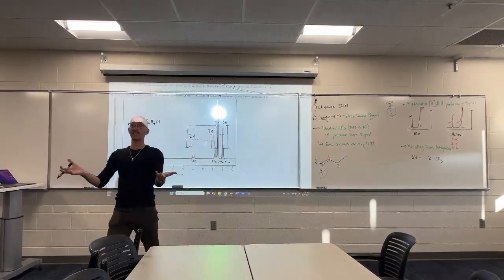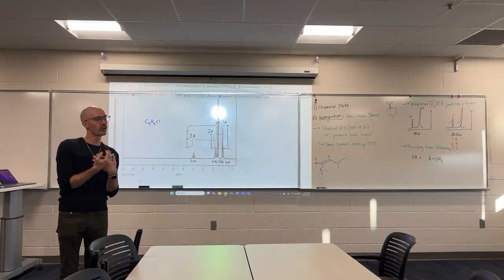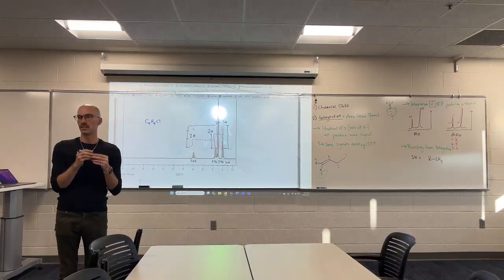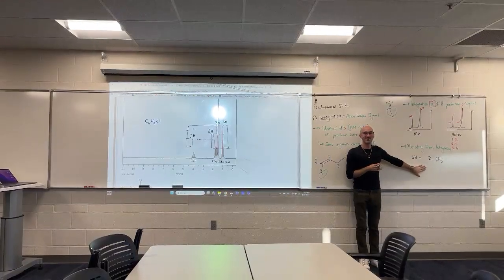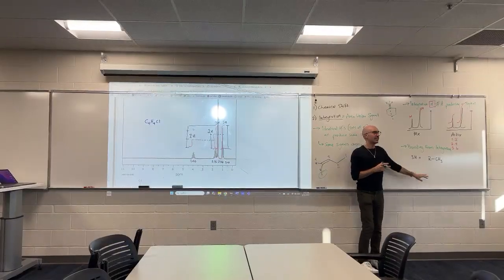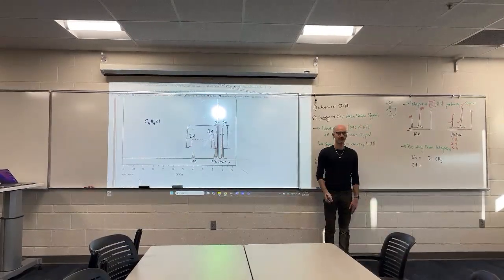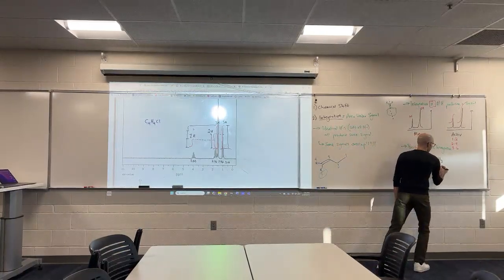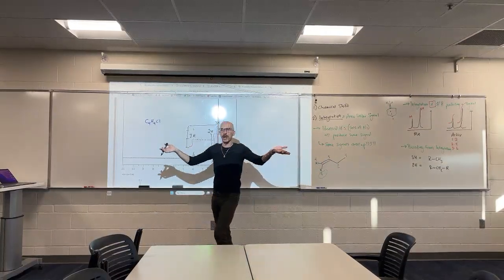It is quite possible that you actually have a CH2 group and a CH group that are overlapping and adding to one signal. And that sucks for you. But most of the time, it's a CH3 group. It is, most of the time. On that same thread, a 2H group, this is often a CH2 group bonded somewhere in your molecule.